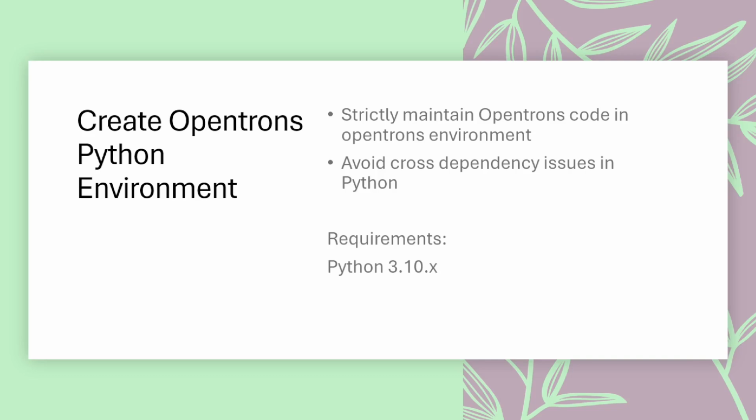One disadvantage of installing Anaconda is that it is a larger package. If you have limited memory and you're installing Anaconda, you might run out of space. That's the only limitation.